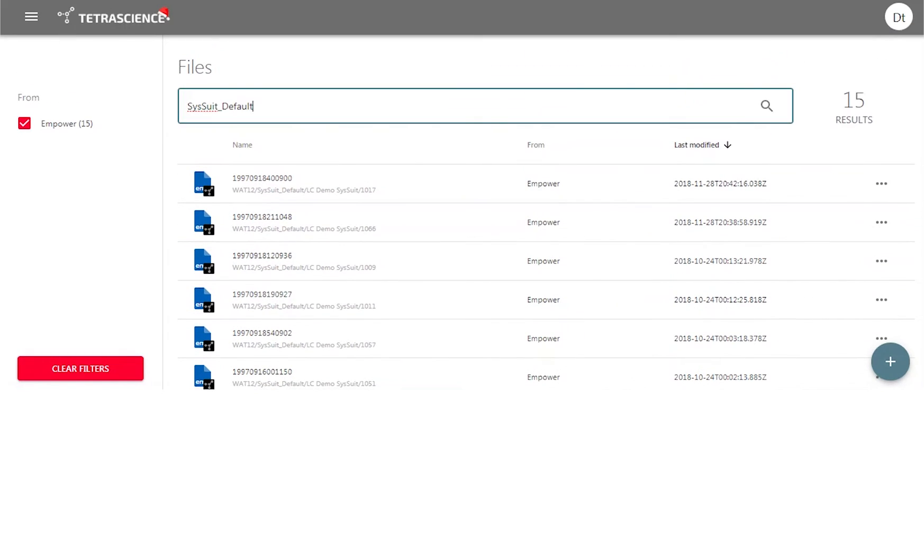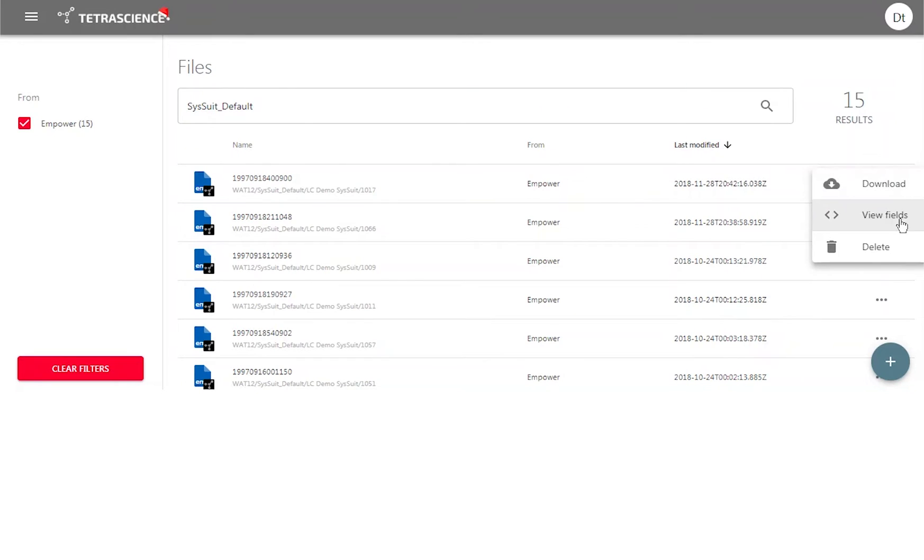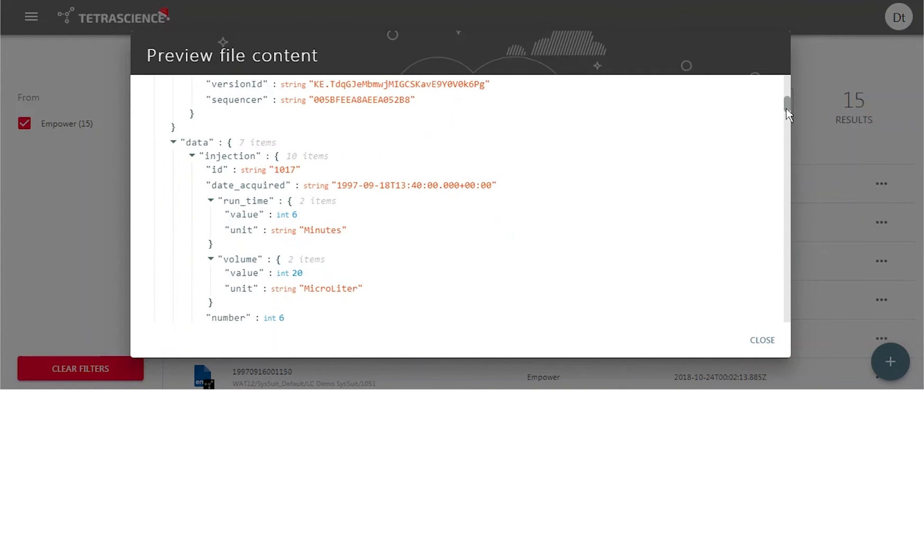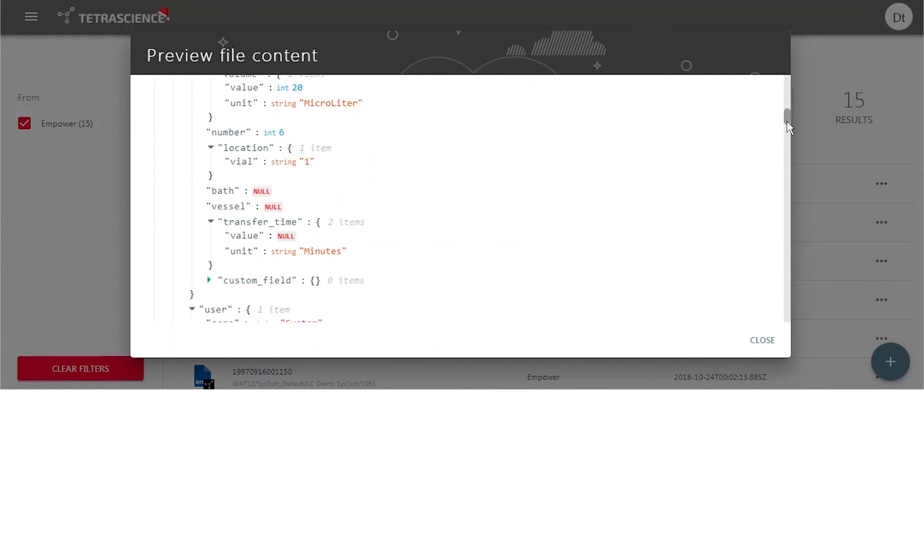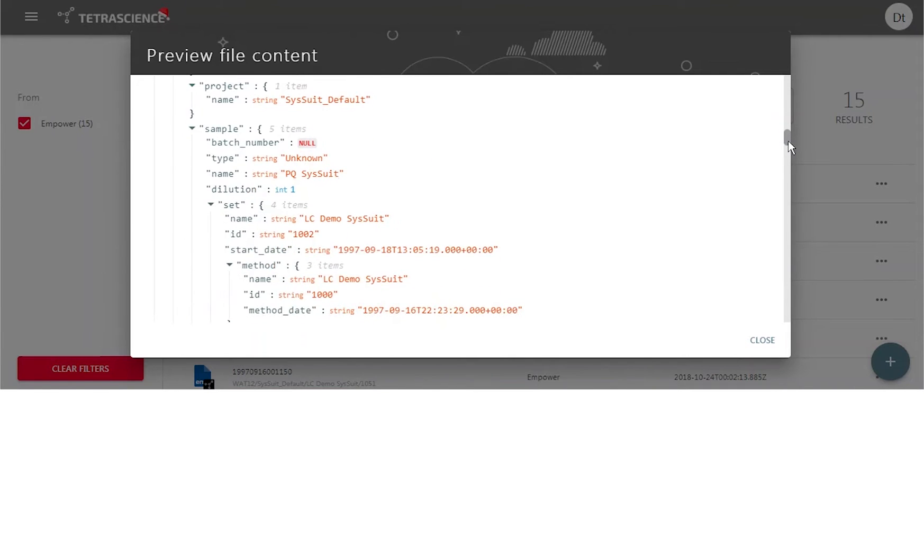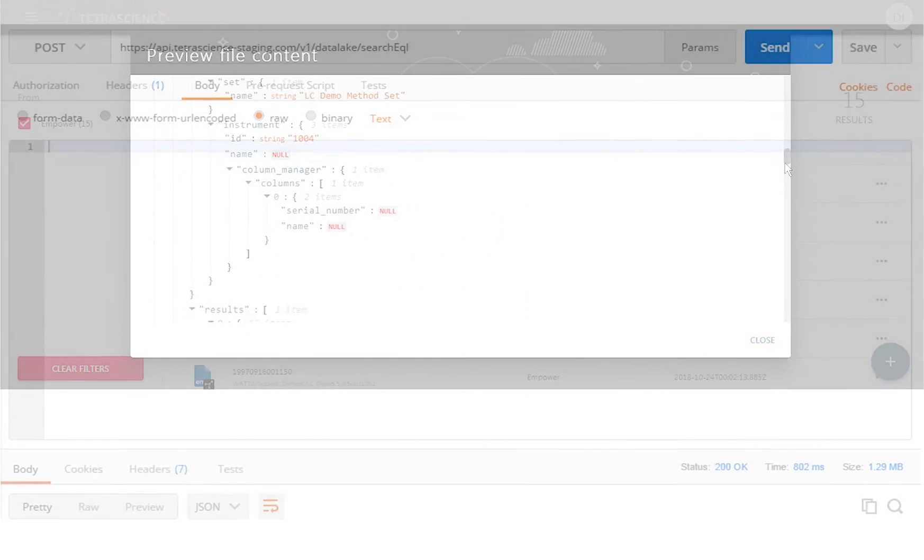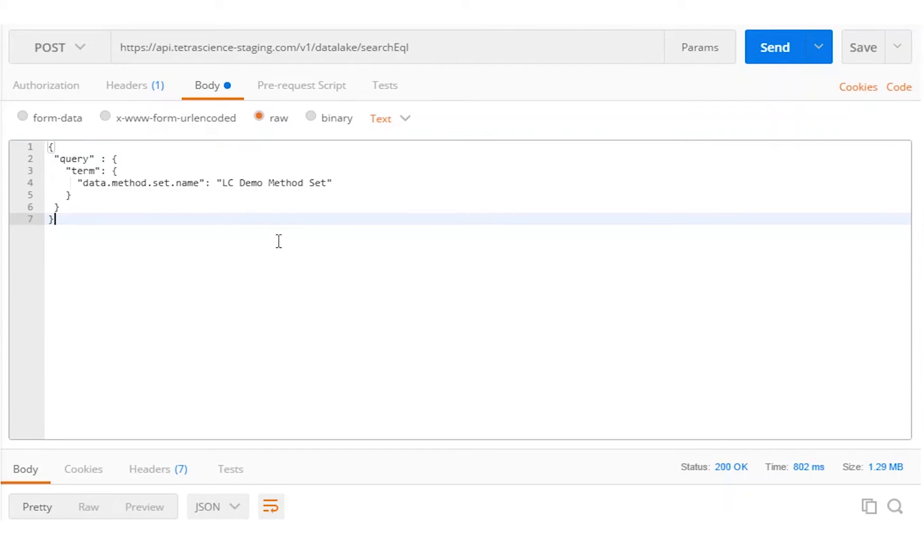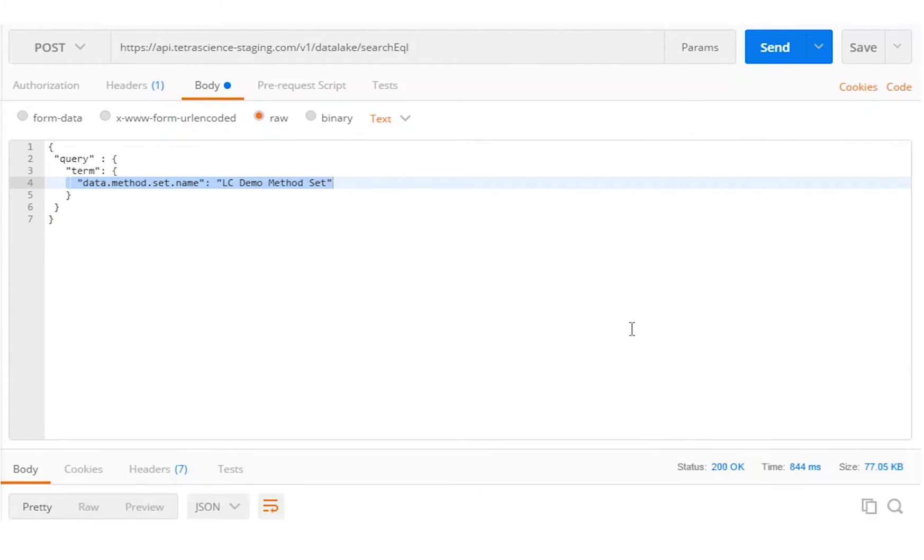We may download the JSON file and preview its contents, which are presented in a human-readable way. The TetraScience Data Platform is fully integrated with Elasticsearch. Here's an example of Elasticsearch running through Postman using Elastic Query Language.